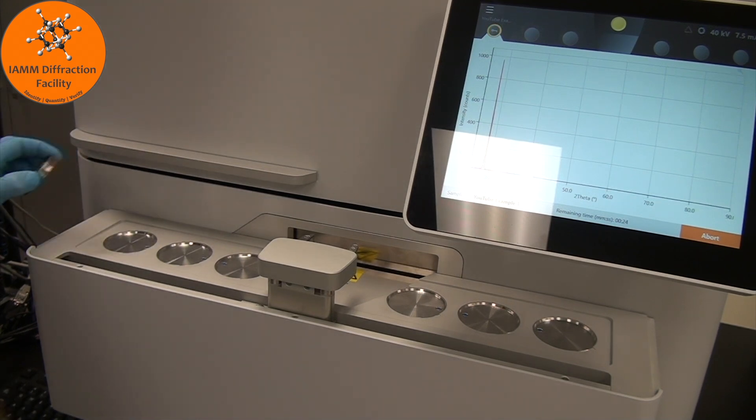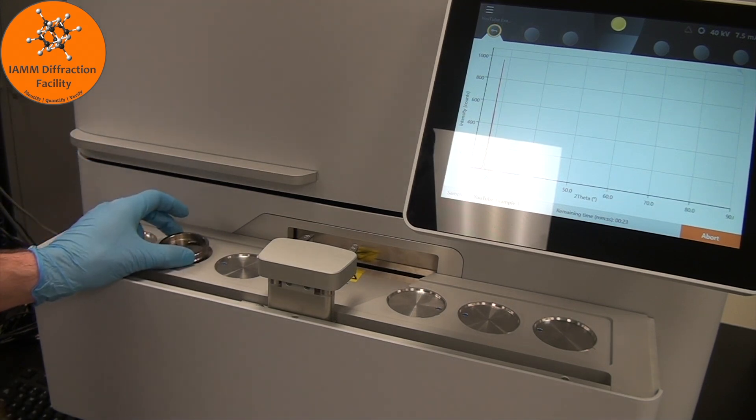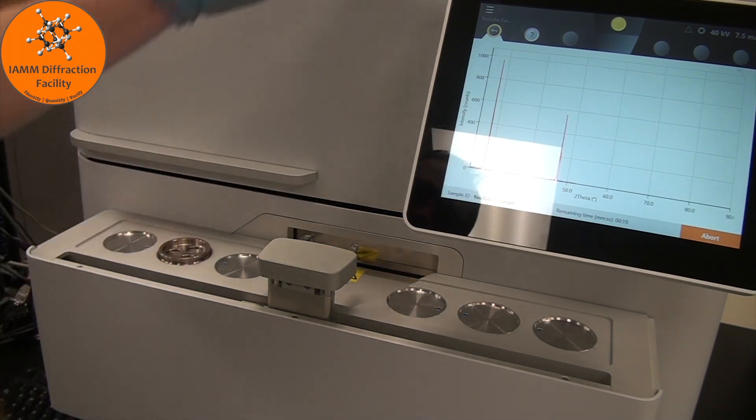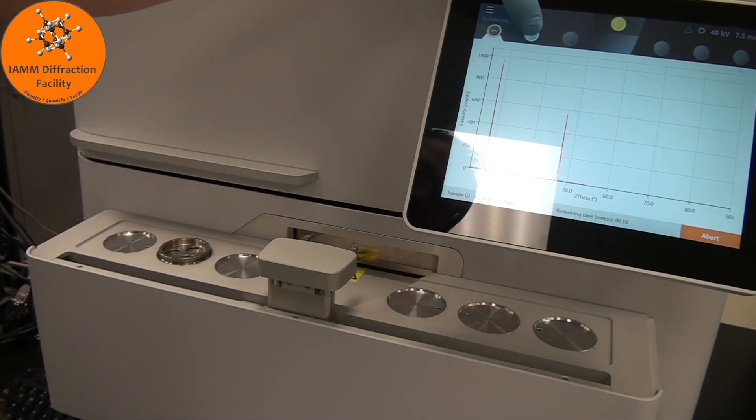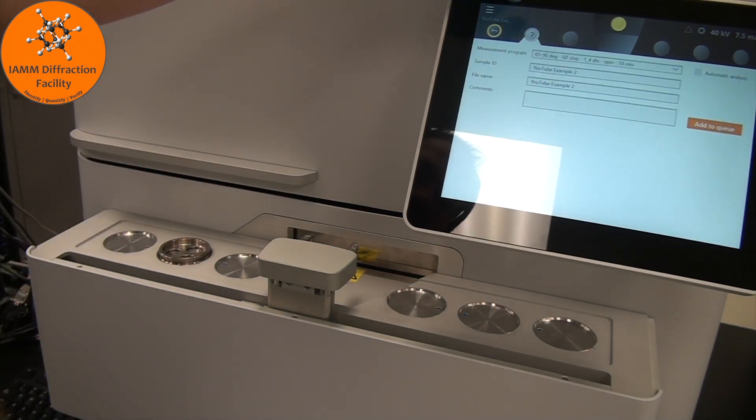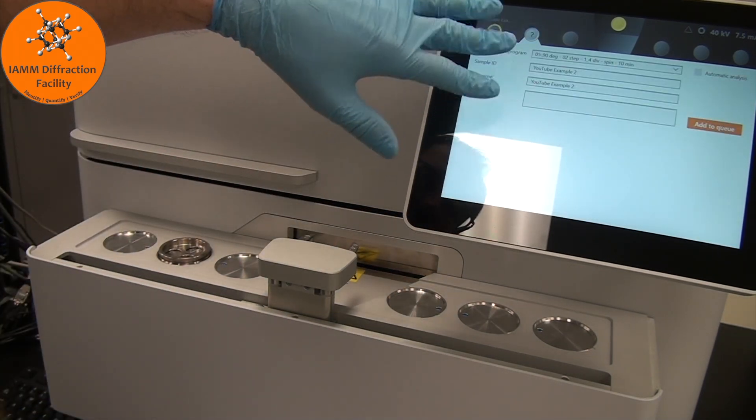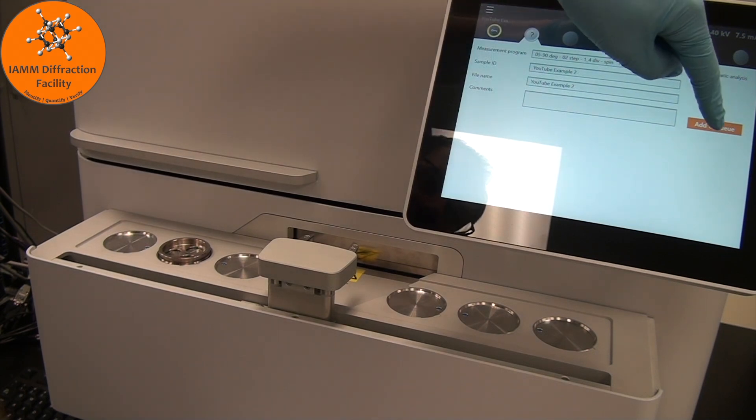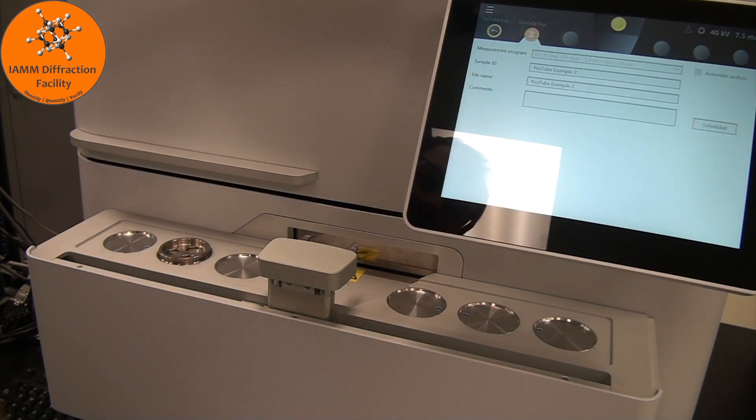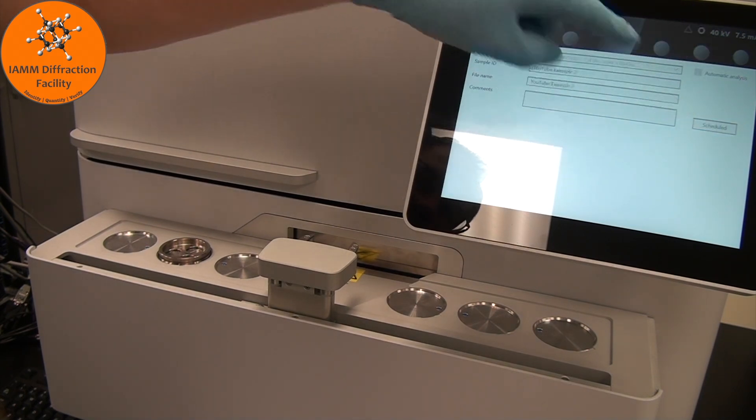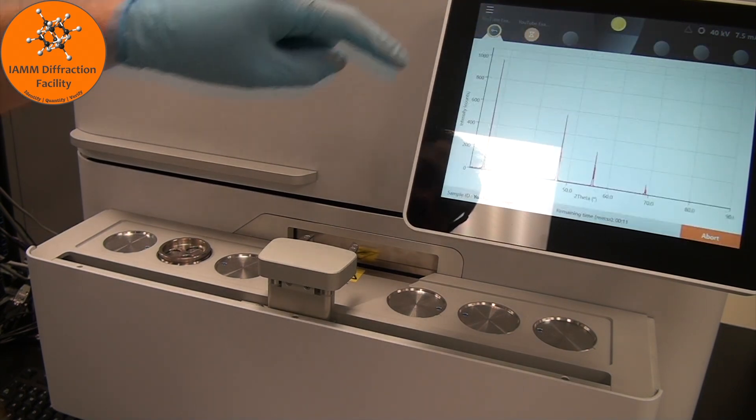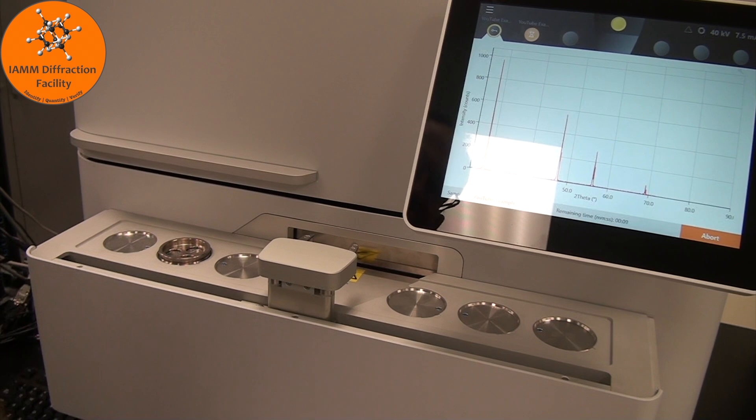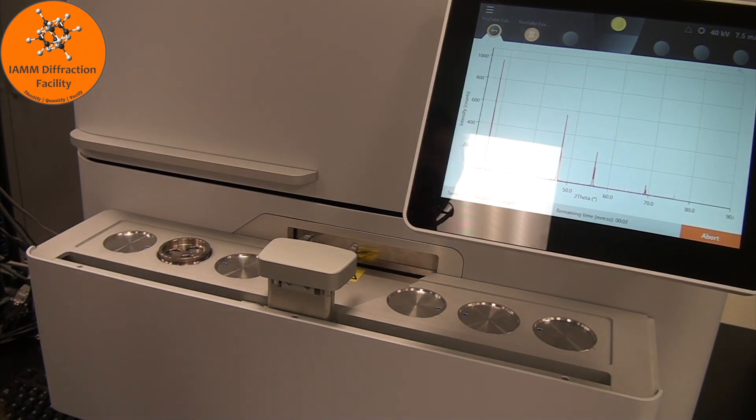We could put our next sample in this next position. Come over here. I've already set this up for the second sample, and then add it to the queue, and you see scheduled. So once this one is done, it will be unloaded and the next sample will run.